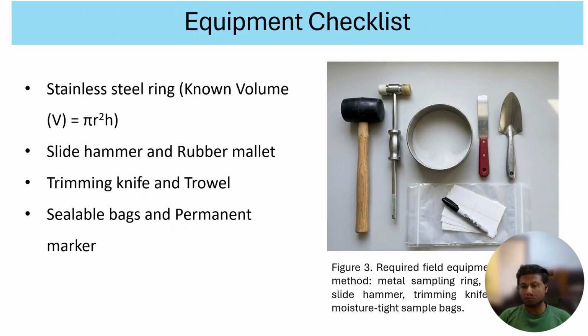I conducted my field sampling and measurements, and data collection took place on April 7. For conducting this bulk density experiment, at first I got ready with the different kinds of instruments that are required to collect the samples. These are the required equipment to conduct the bulk density study.